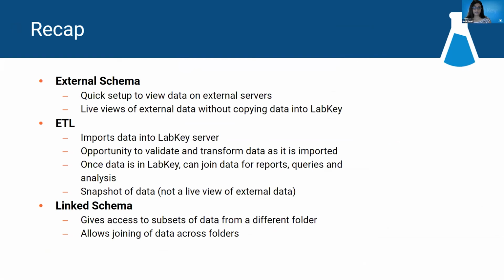It gives us an opportunity to validate and transform data as it is imported. When data is in LabKey, we can join data for reports, queries, and analyze them, create visualizations, and so forth. It is important to note that it is a snapshot of data and not a live view. But the benefits of having the data in LabKey is more than just having a live view. We can leverage a lot of the functionalities that LabKey has to offer once the data is in LabKey.